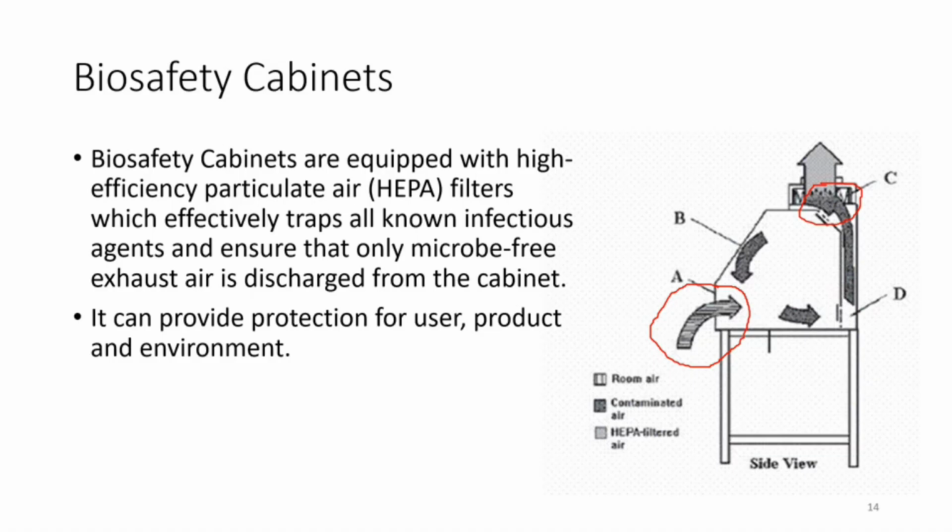And BSCs can also be designed to protect the product as well. Some of the BSCs can be equipped with another filter to filter the entrance air so that the product is in contact with microbial-free air from the outside.